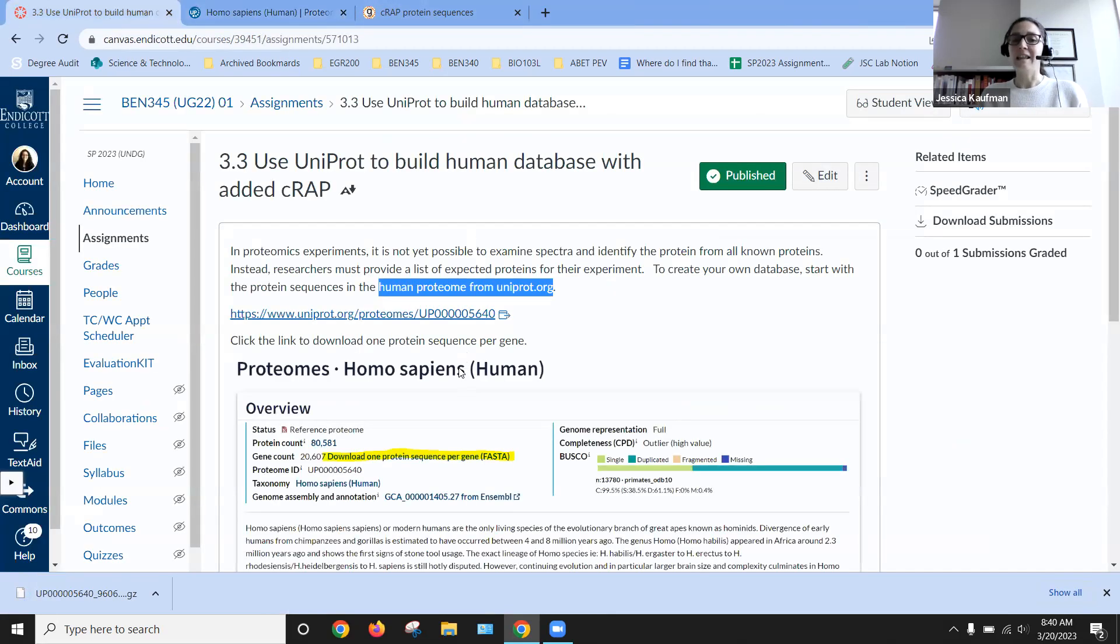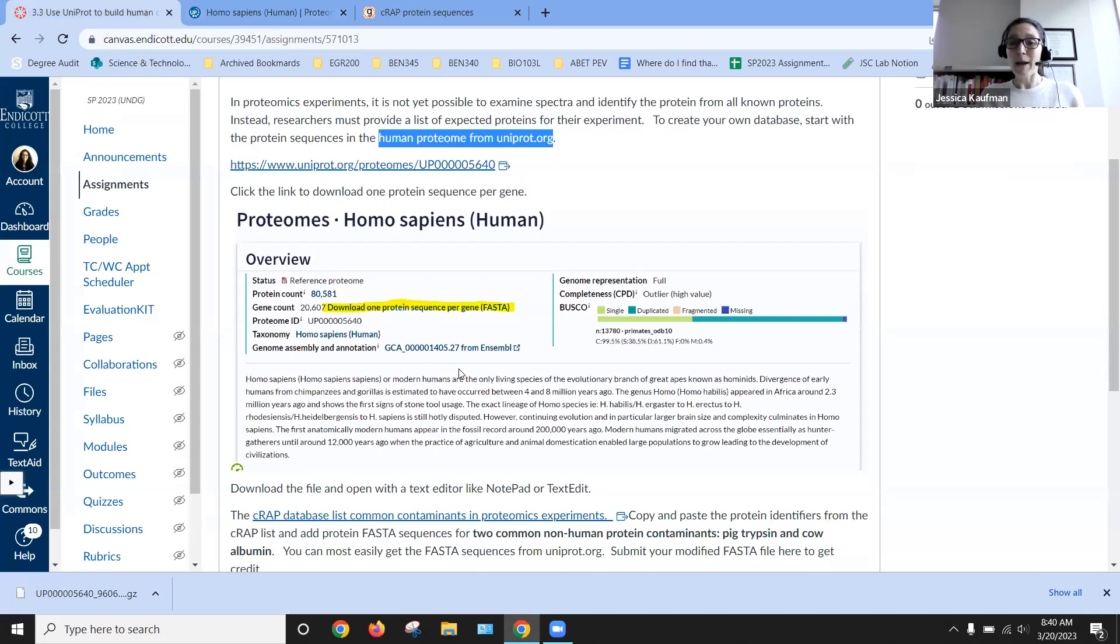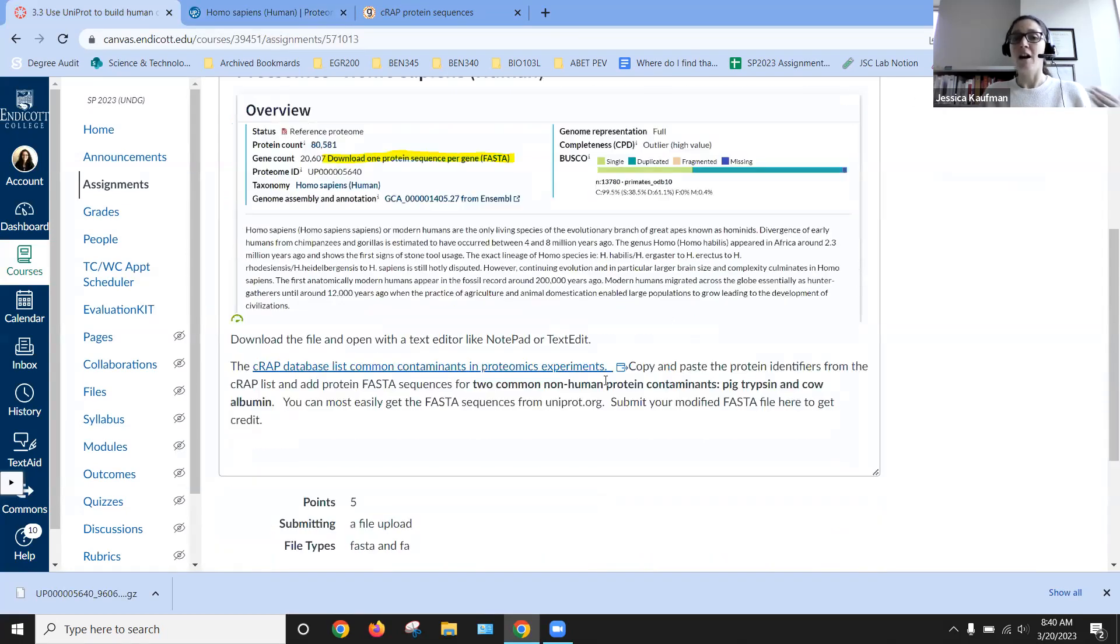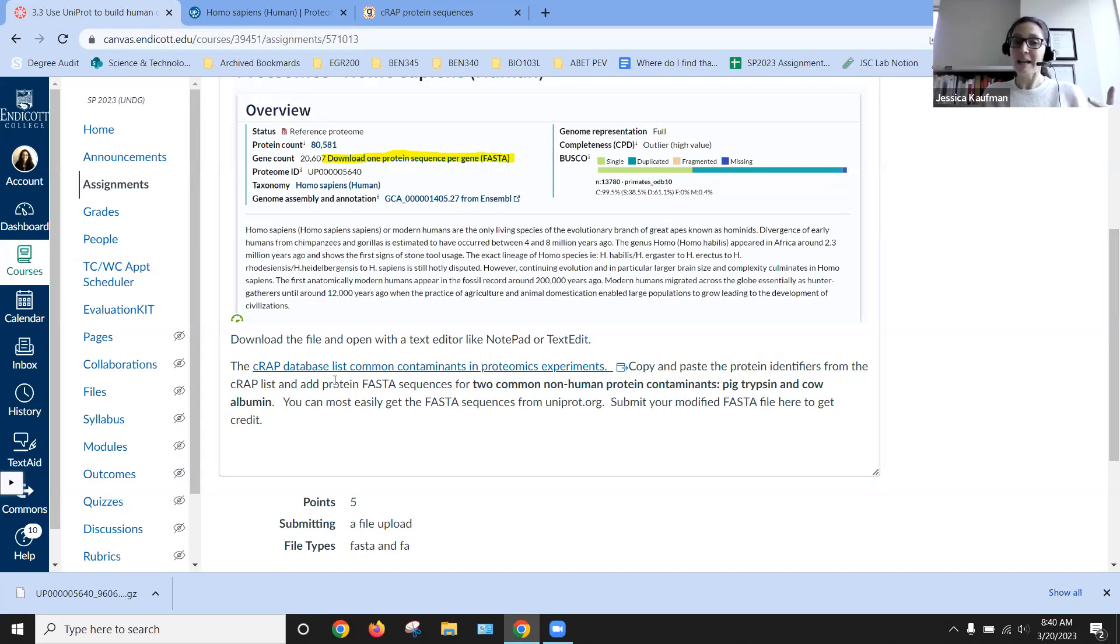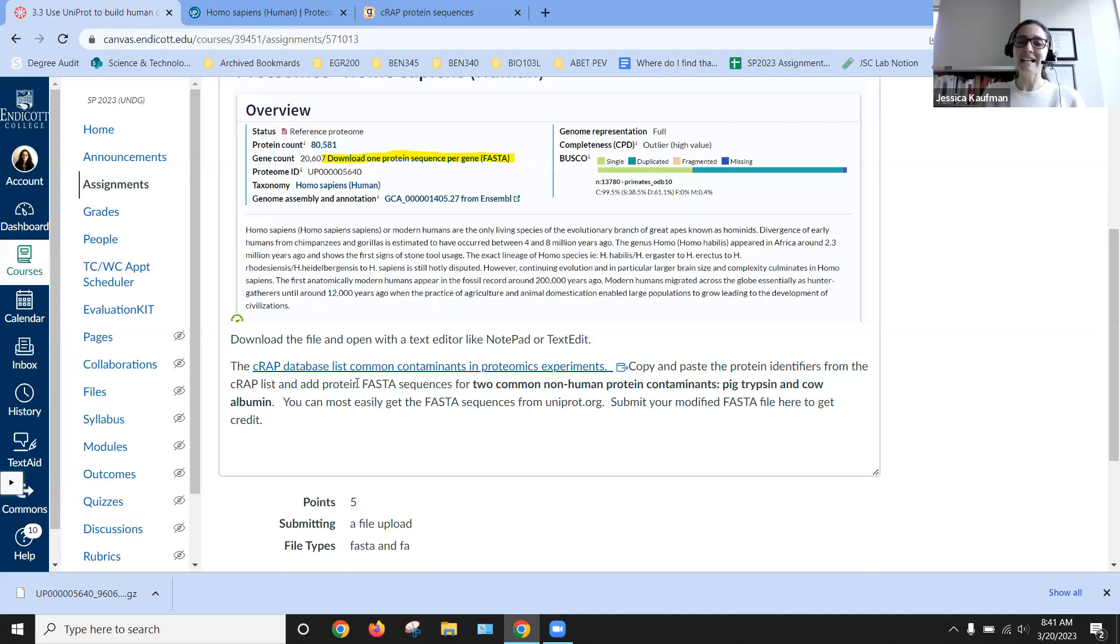The second thing that we might expect to see in a proteomics experiment are common lab contaminants. And so this database is referred to as the C-RAP database, or at least that's what they say it should be pronounced as.